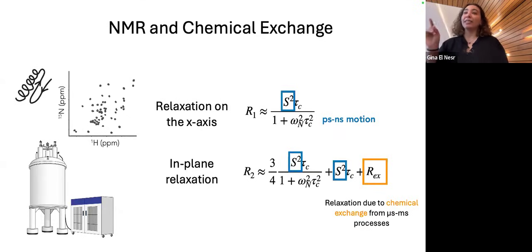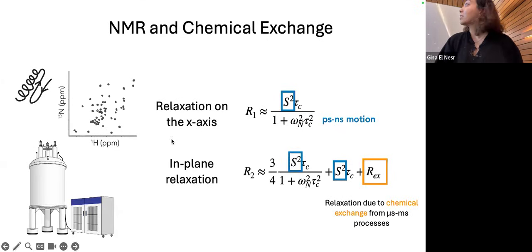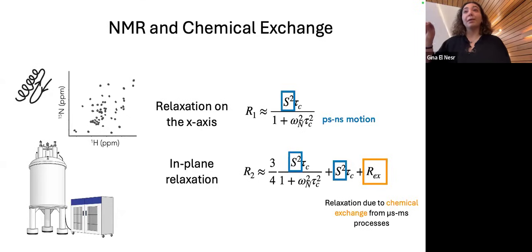And so you get relaxation on two different time scales. This should say z-axis. You'll get R1s and you'll get R2s. And at the end of the day, you get information that directly reads off picosecond, nanosecond timescales, and you'll get REX, which tells you about microsecond, millisecond timescale.